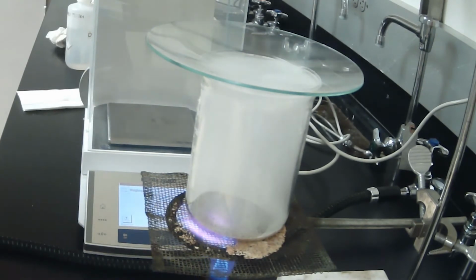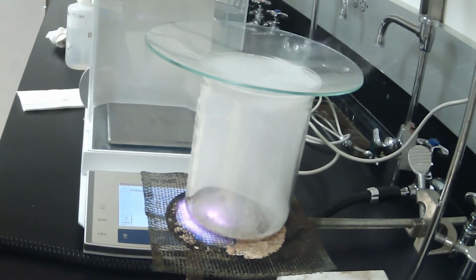But we still have smoke coming off the bottom, so we're not quite ready to start making our 1-inch gap. So we need to keep the bottom really hot, and make sure as much of the ammonium chloride is sublimed as possible.